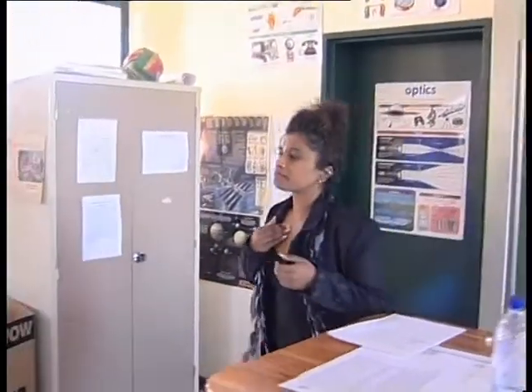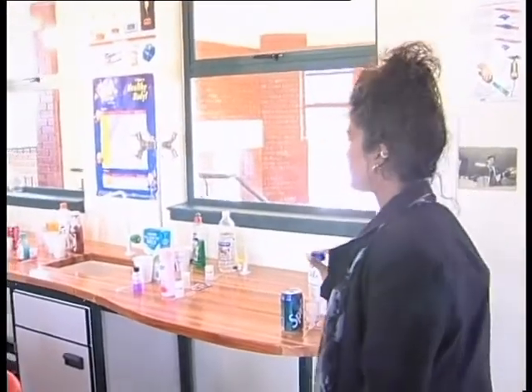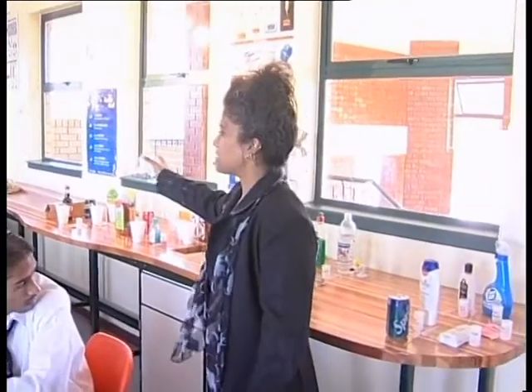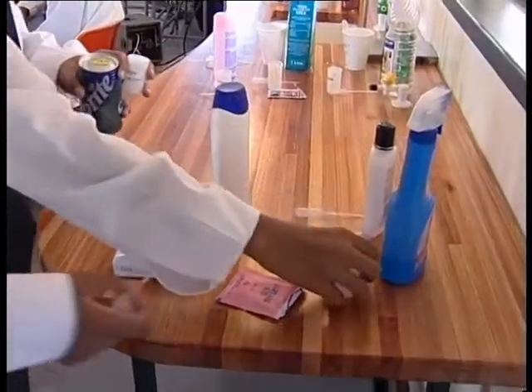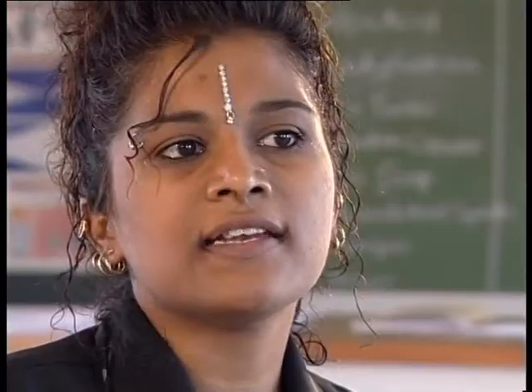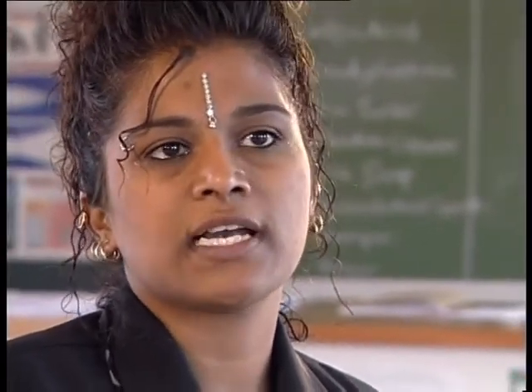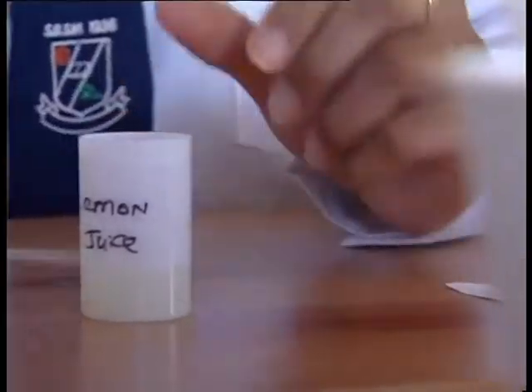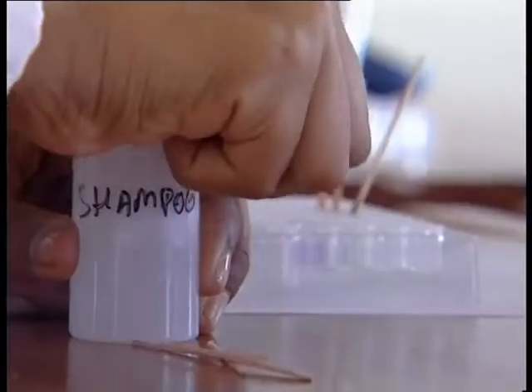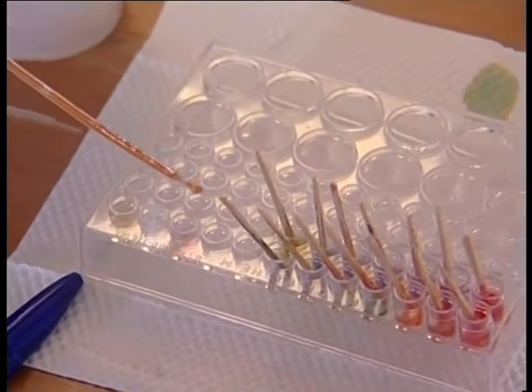In the next activity, learners will use the skills they've already acquired to test the pH of common everyday substances with universal or cabbage-water indicators. Shampoo, household products, those were easy access and things that the kids knew, they saw every single day, they come into contact with every single day. It's better if they're familiar with things and more comfortable and they recognize. They need to see and recognize and be able to know what they're working with.